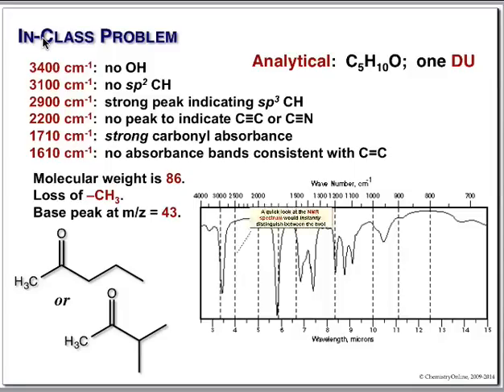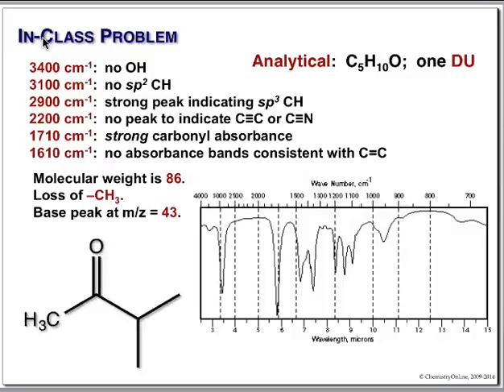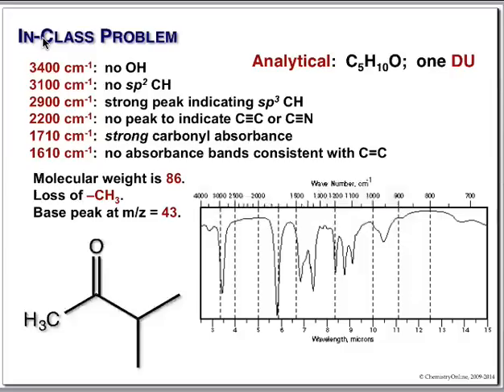In fact, it's this guy right here. The reason that we have such a nice big peak at 43 is that we're splitting here to make both isopropyl and acylium. If we had done chapter 13 by now, we would simply look at the NMR and instantly everybody in this room would say, it's this guy, because the NMR spectrum from this and this are going to be so totally different. Isn't that something to look forward to? You can hardly wait for chapter 13, where we're going to do NMR.